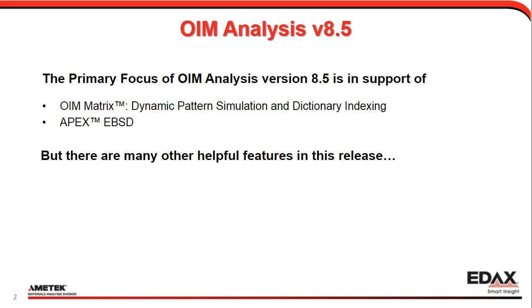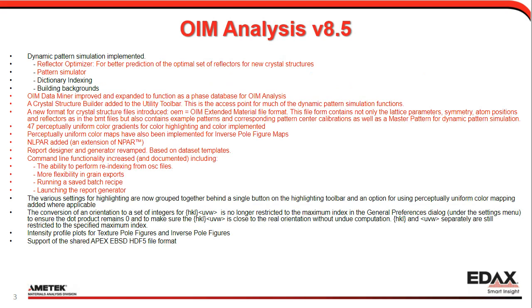webinar. And that was the major focus for OIM Analysis 8.5, in support of Apex, the new Apex software for collecting EBSD data and EDS data. But we're going to talk about some of the other helpful features in this release that haven't got as much attention. So here's the list of all the things in our release notes, and I've highlighted the ones in red that we'll be talking about today. There are a few others, some minor things that I won't be talking about.